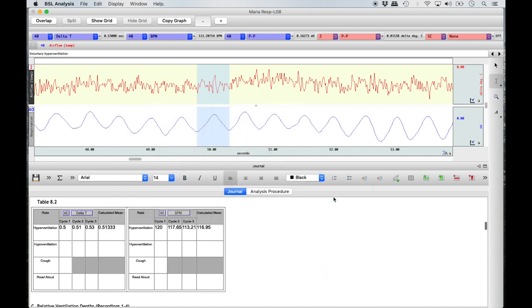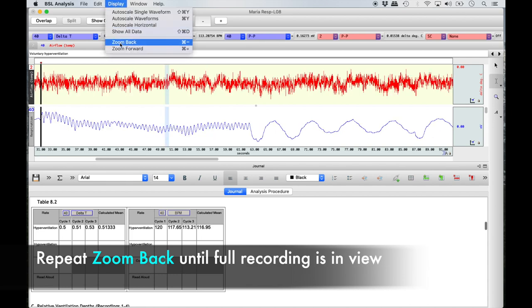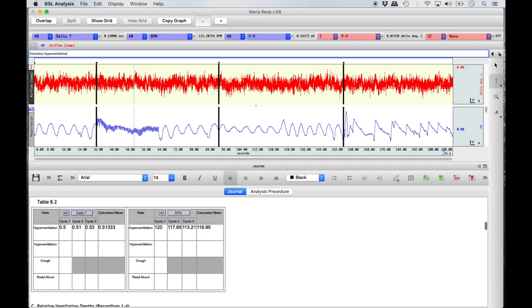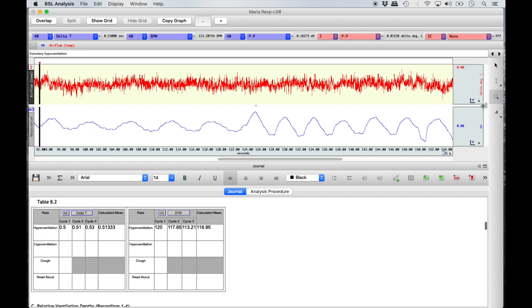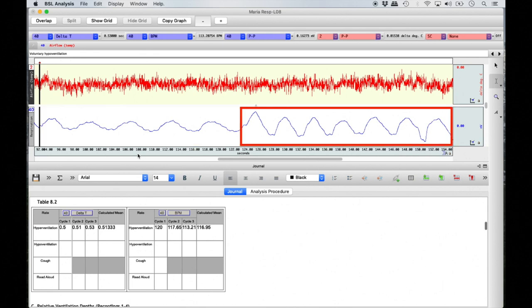Once the hyperventilation rows are complete in Tables 8.2 and 8.3, select Display from the top menu bar and then Zoom Back. Select the next event arrow and ensure that Hypoventilation is listed in the top text box. Using the magnify tool, drag a box over the entire hypoventilation segment and repeat the same steps to complete the appropriate rows in Tables 8.2 and 8.3. Remember that similar to hyperventilation, the first 30 seconds is when the subject was hypoventilating and the last 30 seconds is their return to normal breathing.